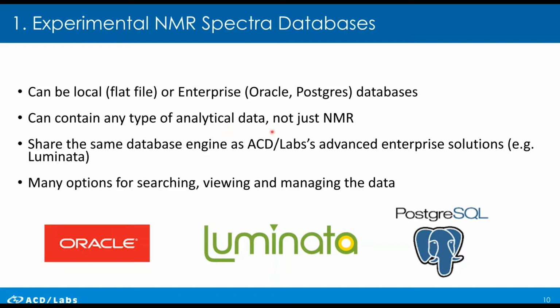They can contain any type of analytical data, not just NMR. As I said before, we have also software for MS and chromatography and other things, so this data can go in there as well. What is of real importance and interest is that they share the same database engine as the ACDLabs' advanced enterprise solutions, for example, Luminata, if you are familiar with this software, which is a software for managing analytical data in a development environment. So this is using the same engine as our standard databases. Of course, we have many options for searching, viewing, and managing the data.